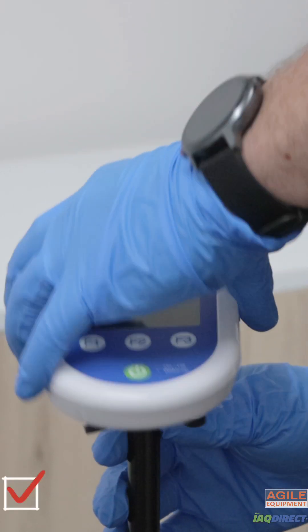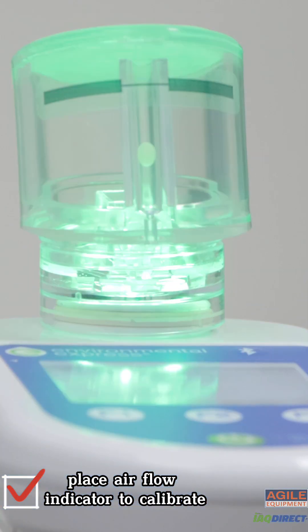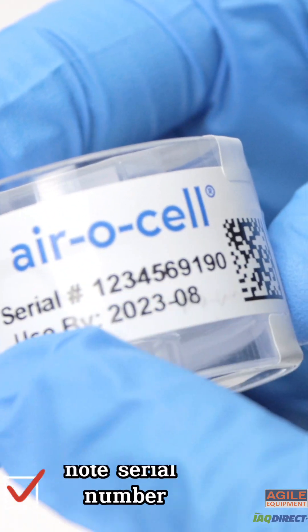Mount the IAQ 15 pump to the tripod. Place the air flow indicator onto the pump and select calibration. First, check to see if your cassette is in date.